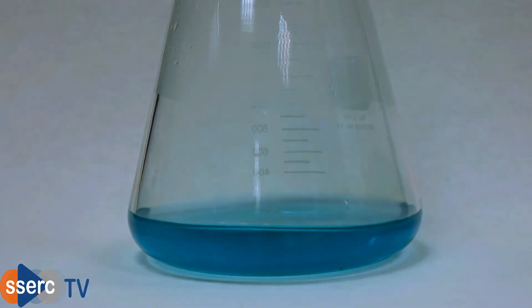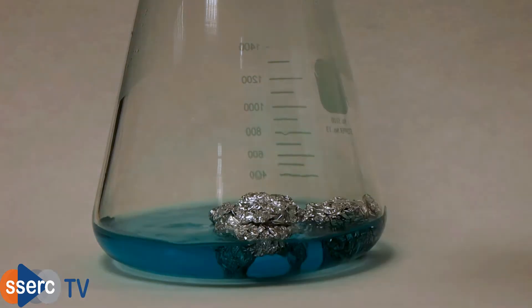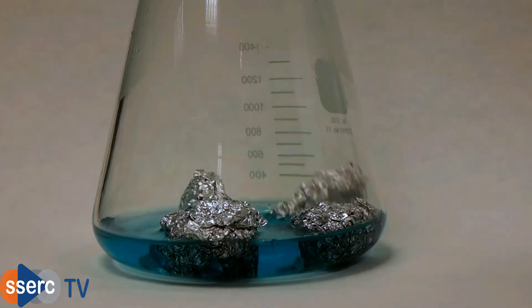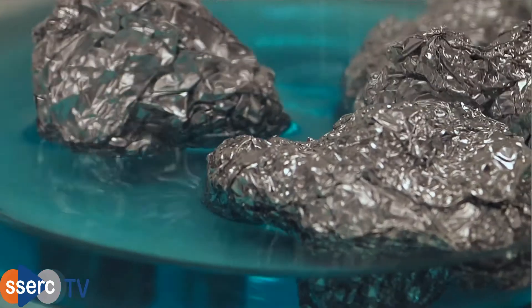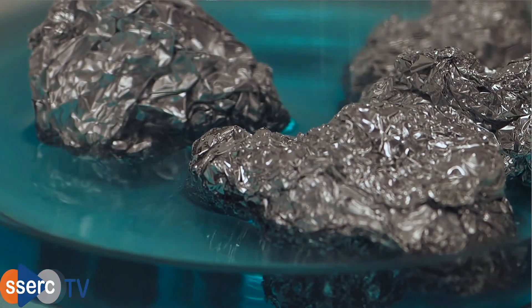Once dissolved we add a few balls of aluminium foil. Within a few seconds you see some bubbles appearing and steam and soon after that you'll notice the appearance of reddish brown metallic copper.